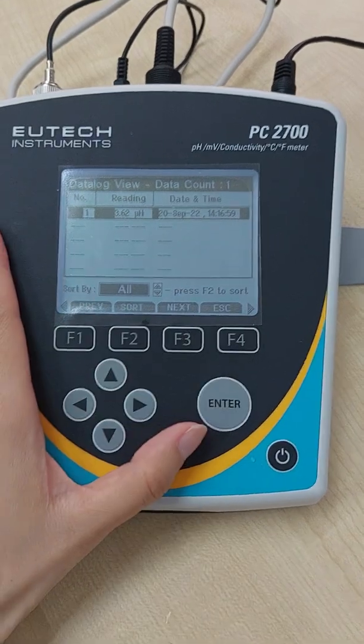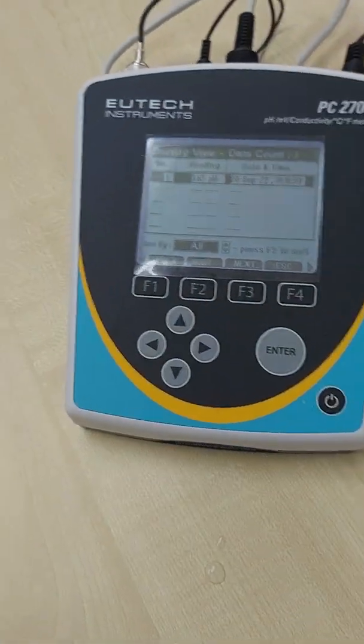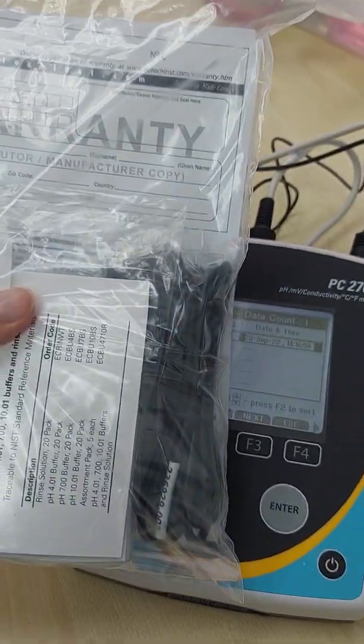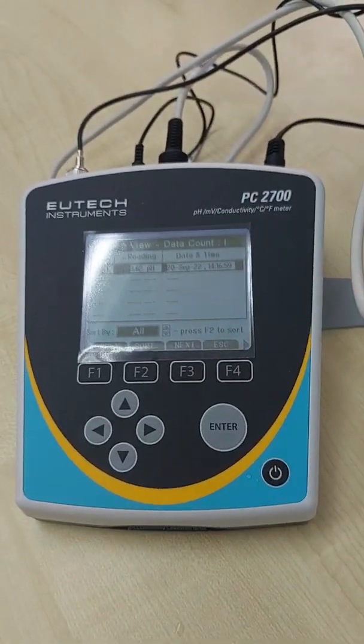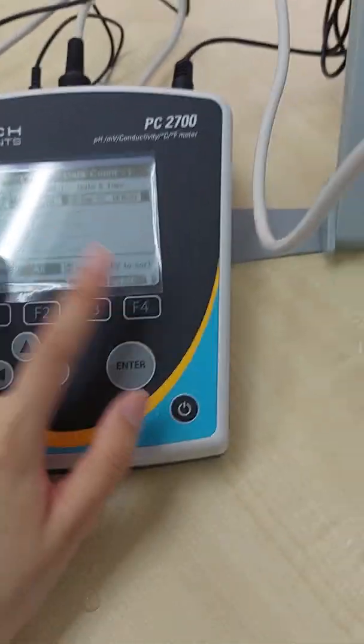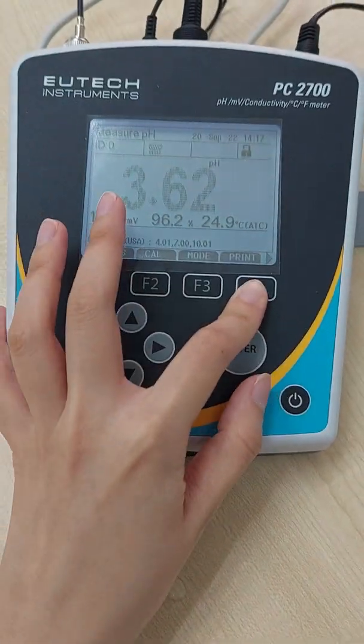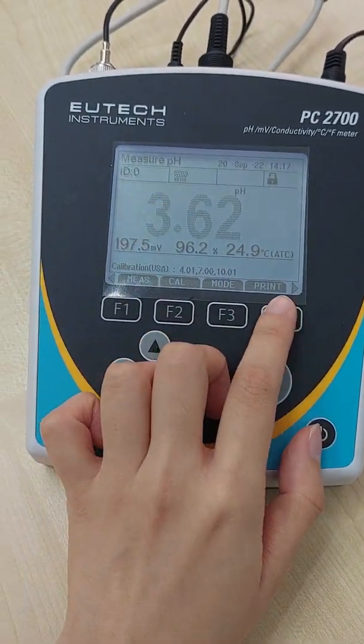So also this meter provides an RS-232 cable for you to connect to PC for data transfer. You can also connect to printer as well. Like print mode right here.